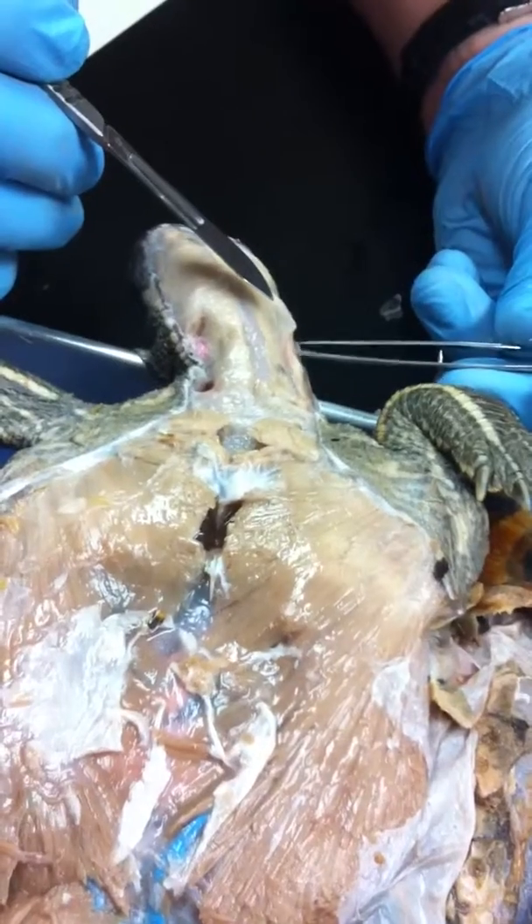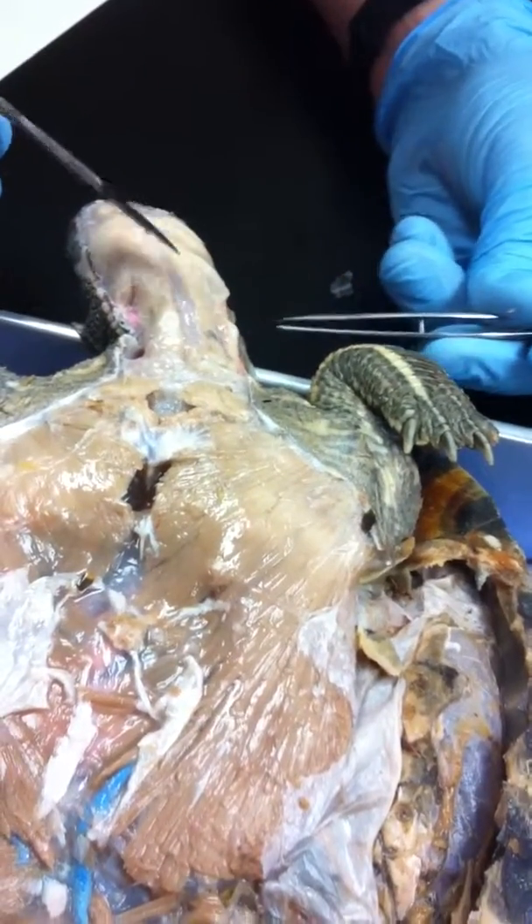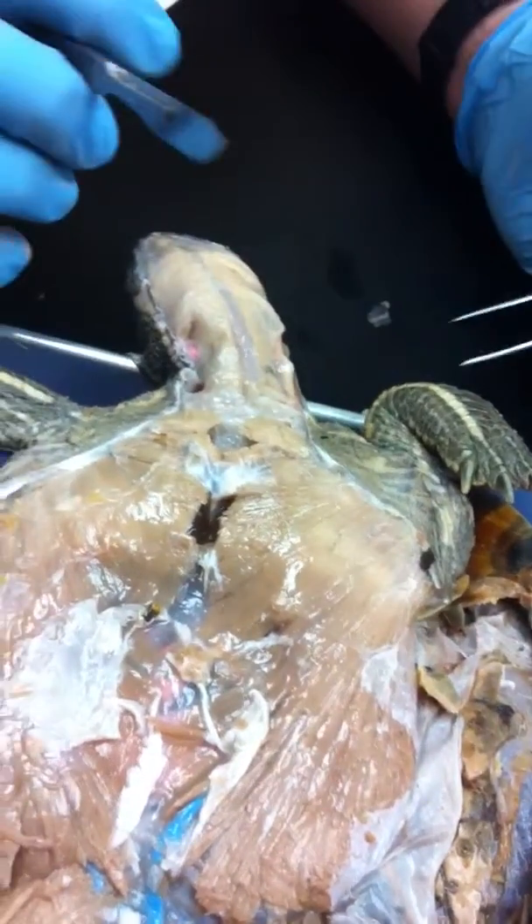This is a pretty small muscle — see that little rubber band there? That's your sternomastoid.